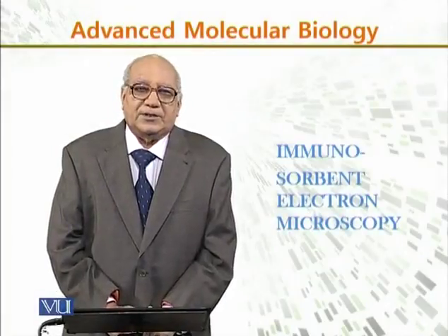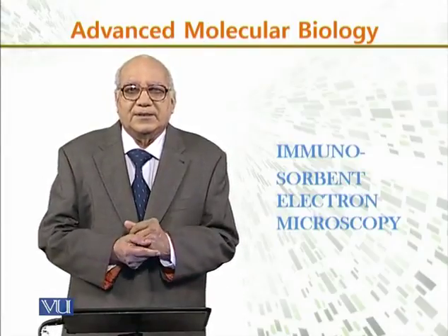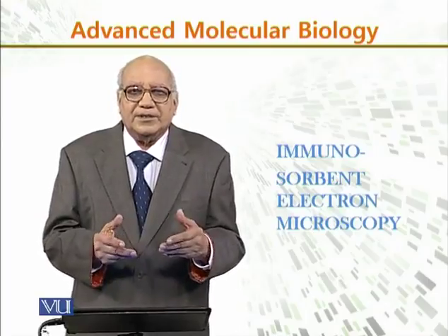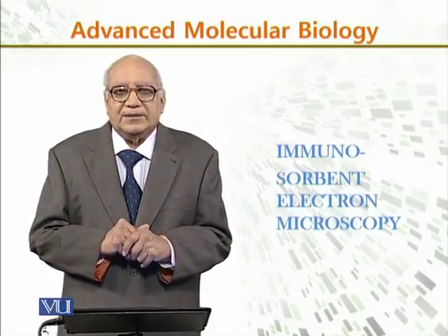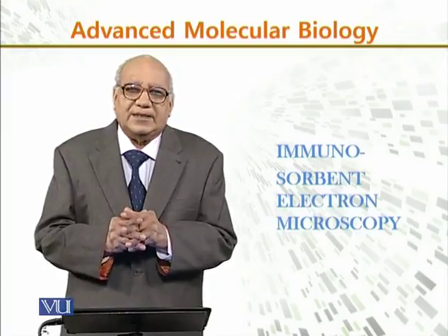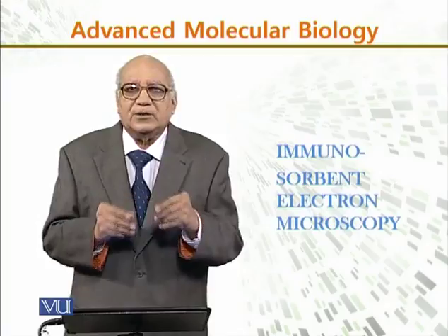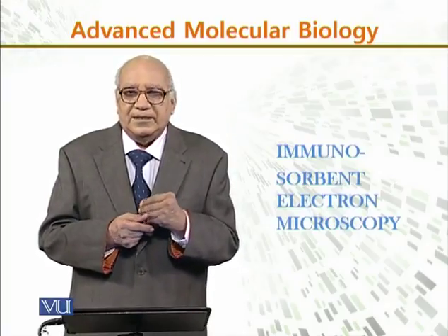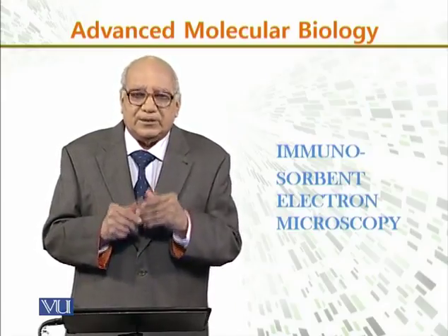Different techniques are used in advanced biology to study the cells, viruses, and bacteria. In this segment, we will discuss an important technique by the name of immunosorbent electron microscopy, ISEM. Immunosorbent electron microscopy.